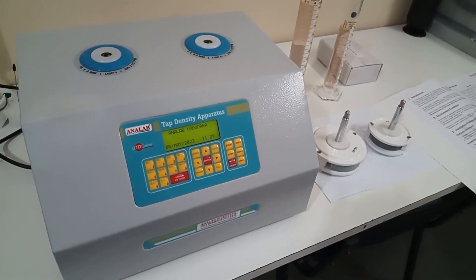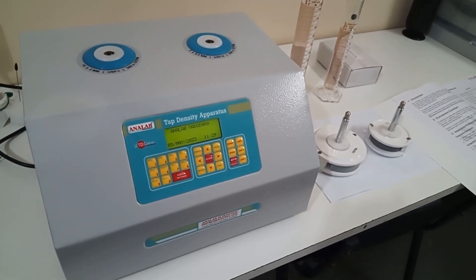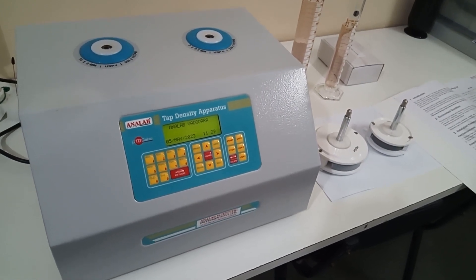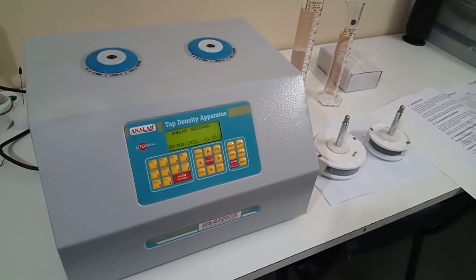Welcome to ANALAB. We are happy to introduce our tap density apparatus model micro TDCAL50.